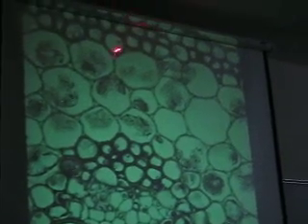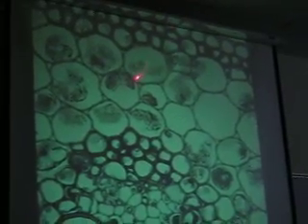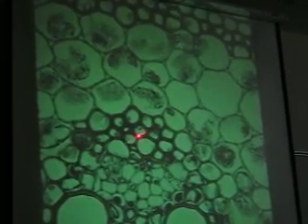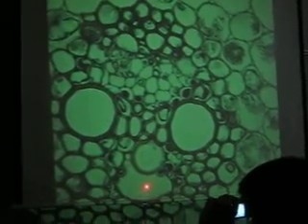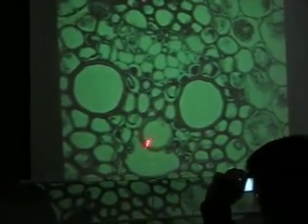And if we go higher power on the vascular bundle, okay, so here's the parenchyma. There's the epidermis. There's parenchyma here. Parenchyma. See the cytoplasm? Here's sclerenchyma. It's stained red, but it's sclerenchyma. Look at the phloem. Okay, stained green. See a nucleus? That's probably a companion cell right there. And on your lab, I might say find the protoxylem, so it's ripped. The protoxylem stops elongating, but the stem continues to grow, so it's ripped.